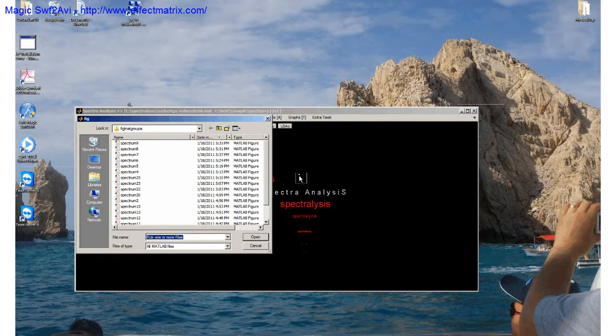So what I did is I separated them into two groups for Spectralysis to analyze them. But in the future, I expect to have all my naturals well defined by you, and my treated well defined by you, so that we can create two very well defined systems, so that after that any other sample will be well defined.